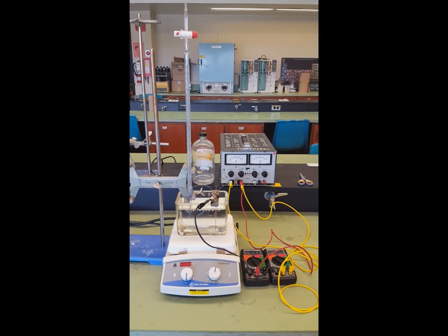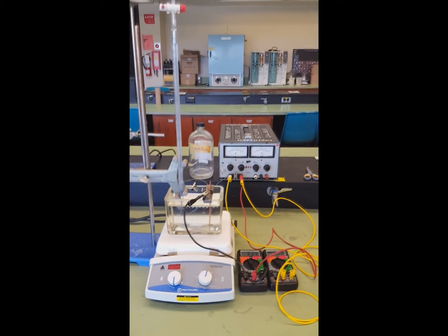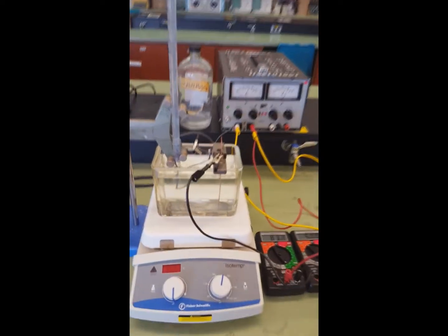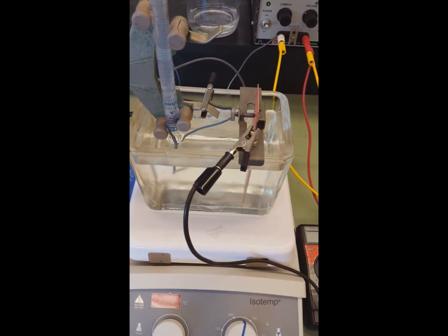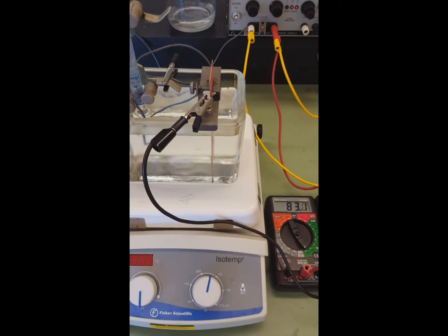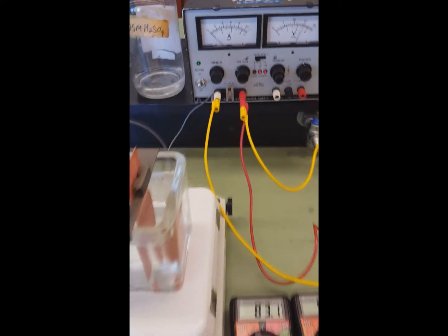Right, so let's watch the video and I'll explain as we go. So we see the heat is turned off, the stir's spinning about 500 RPM. The right side of the tank contains the copper plate, which is connected by the black wire through the ammeter and then on to the power supply.